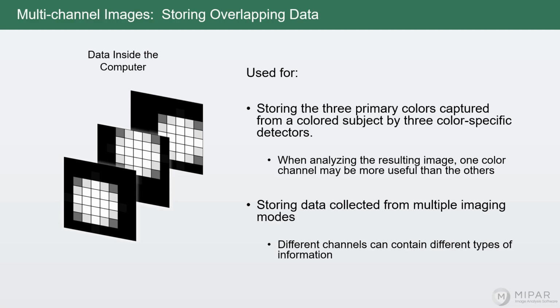And you might find when you go to start analyzing those images that one channel has the information that you want. So for instance, often we see that the green channel is more in focus, while the blue channel is not very in focus. It's known as chromatic aberration. That happens actually quite often. Also, based on the color of features, you might care about one channel over another. If you're trying to find red features or green features, you might use one channel or the other to see those.